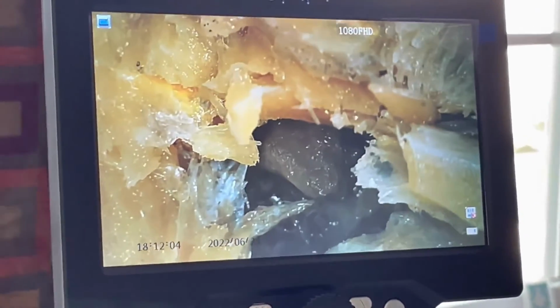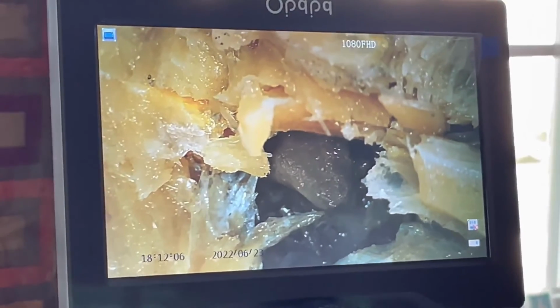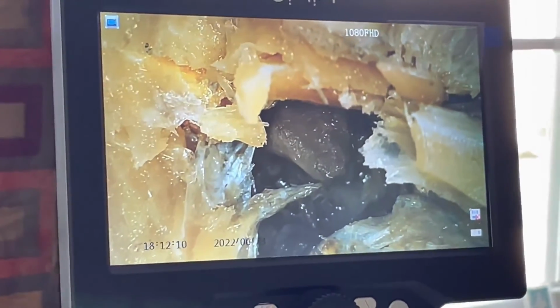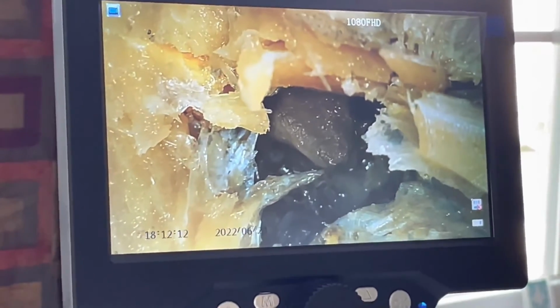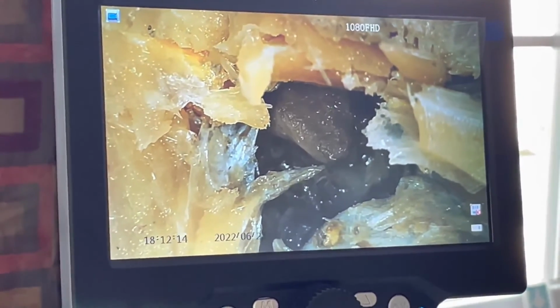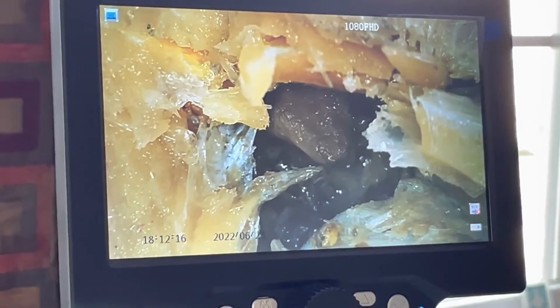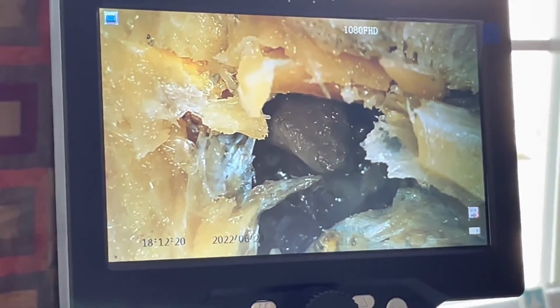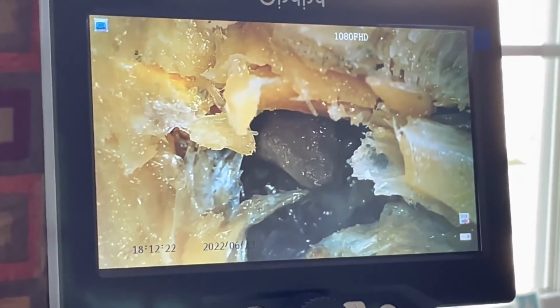The perch has a two-chambered heart, but here it's kind of hard to differentiate the different chambers. It has one atrium and one ventricle. The ventricle sends blood to the gills where it becomes oxygenated, and the atrium collects the blood from the rest of the body.